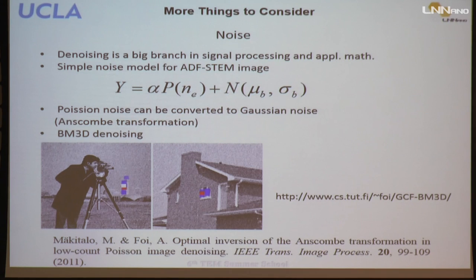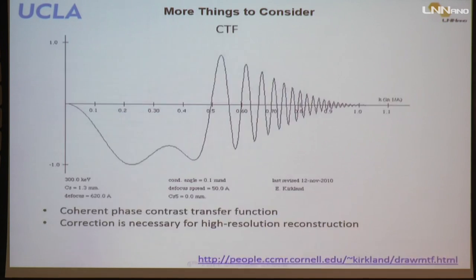We actually get very good results by applying BM3D denoising. This is a well-known, very good denoising software, and I will explain further tomorrow for our recent atomic resolution work. So you have to consider noise for better reconstruction.